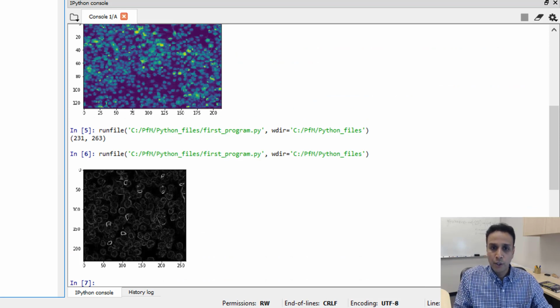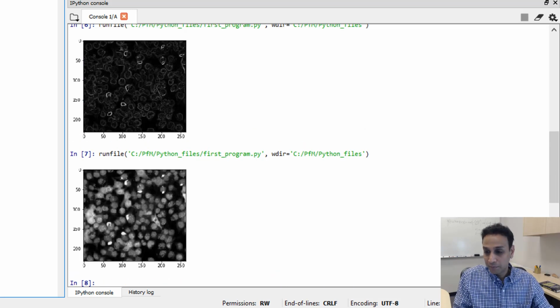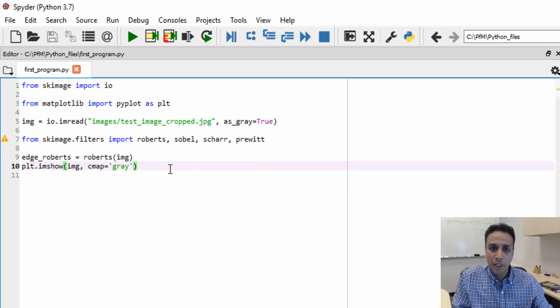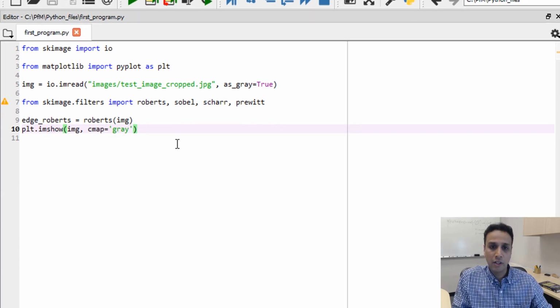In fact, let's go ahead and show just the image to begin with, so you can see how the original image looks. We can take some time to plot all of these, but I don't want to waste time typing a lot of code only to arrange all these images side by side. In fact, I can copy and paste. I have a different screen where I've written this, so let me copy and paste that in a second. This is how you just do edge filtering. In fact, let me copy and paste all the other edge functions, and here they are.